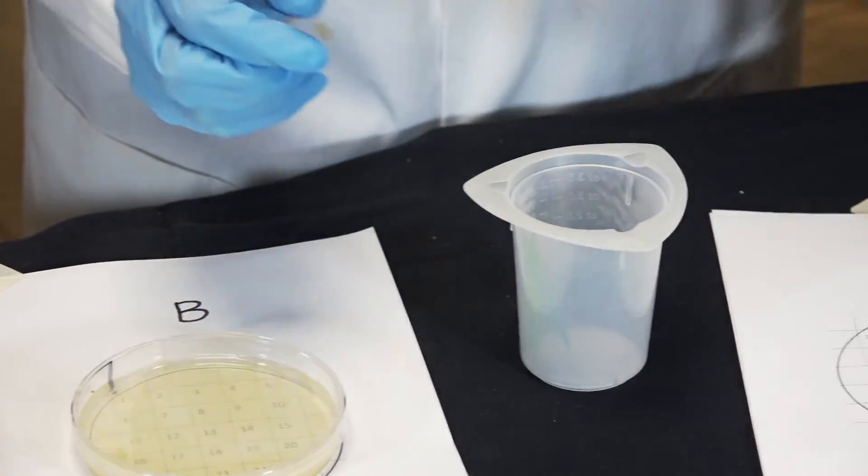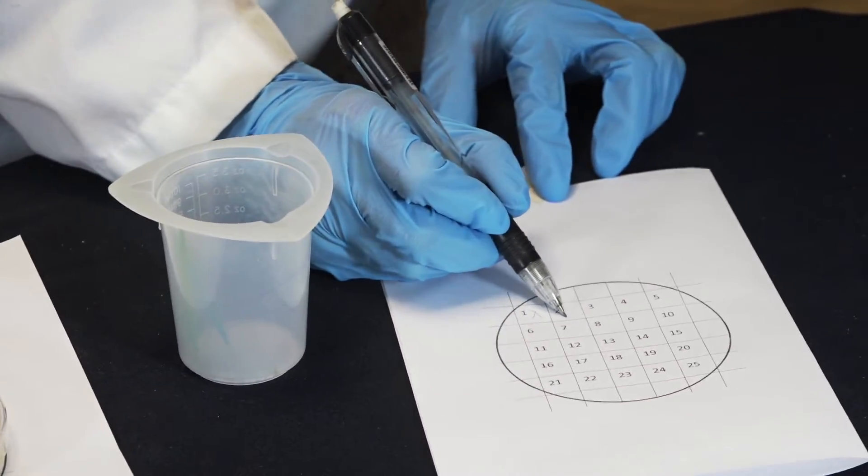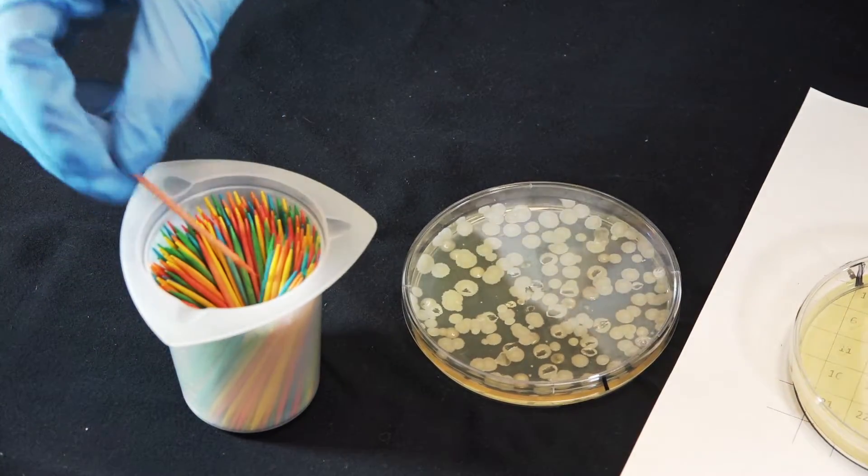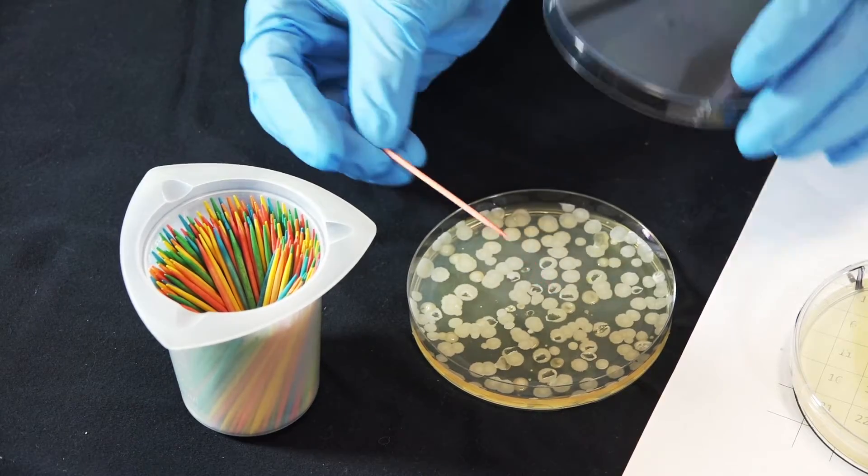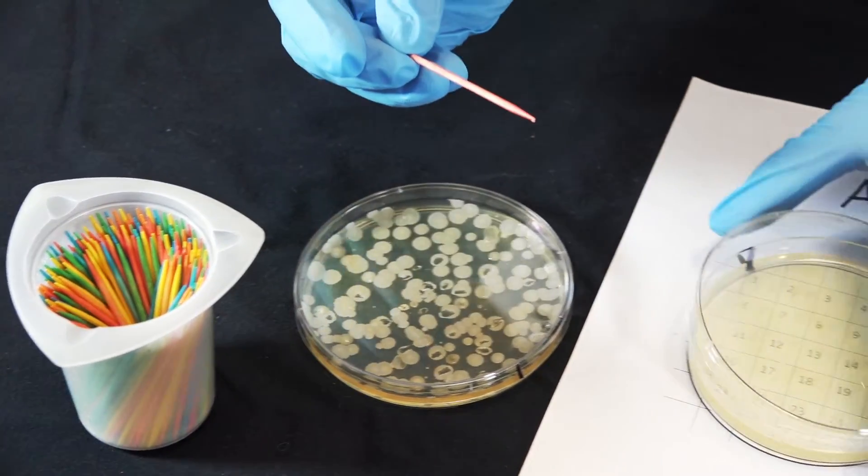Then discard the toothpick and mark off square two. Continue picking colonies until you've replica plated 25.